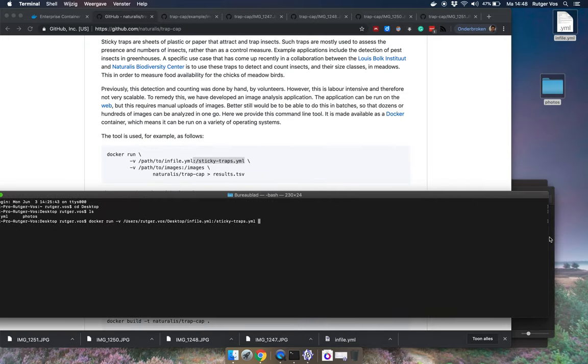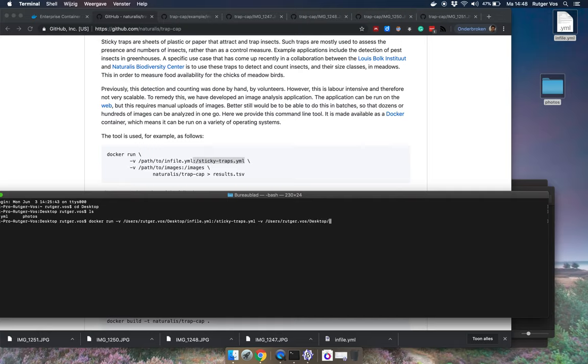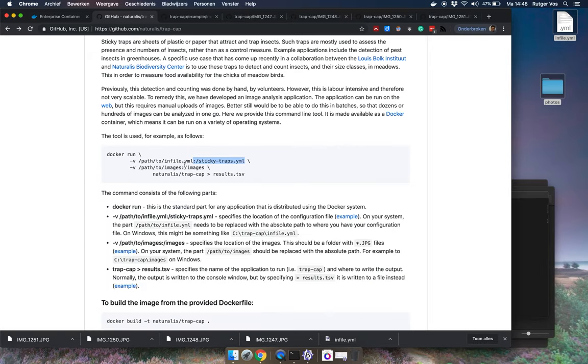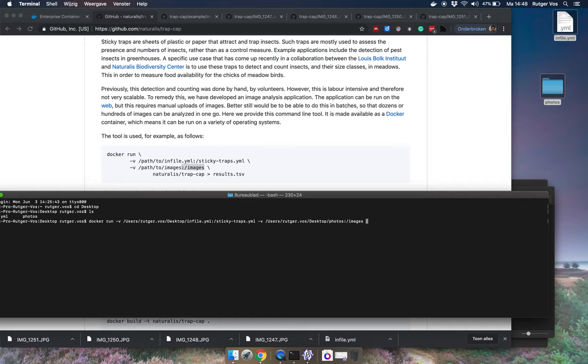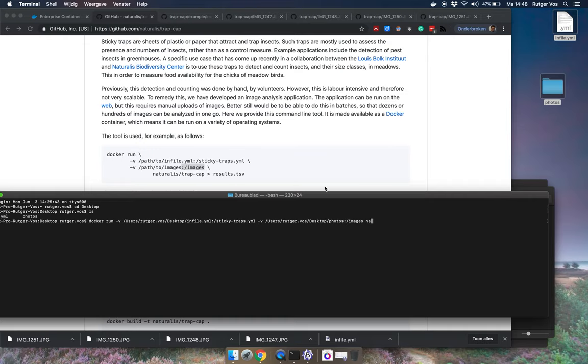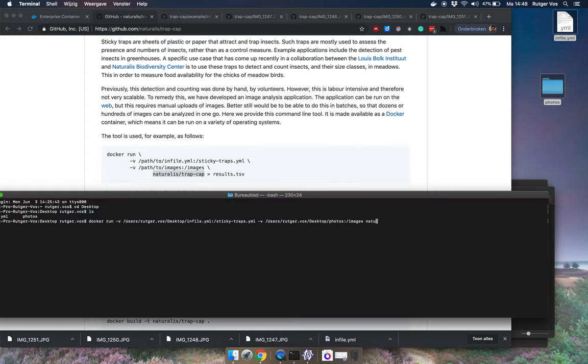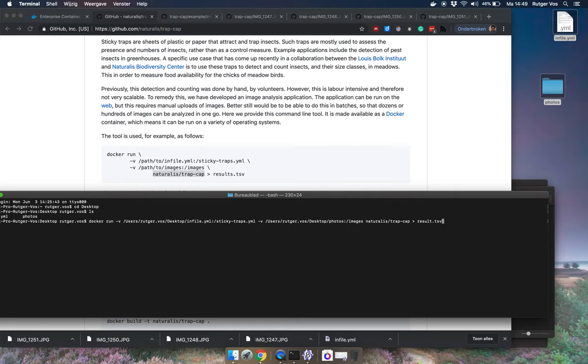I also have to give it the location of my photos so again this needs to be an absolute path. So users, username, this will be something else on your system, desktop photos. And then this next part here is also always the same. And then the name of the tool, so naturalis slash trap cap. And then the output file. So you can give this output file whatever name you want but I'll just call it results.tsv, tab separated values. Okay well let's see if this works. I'm now going to hit enter.